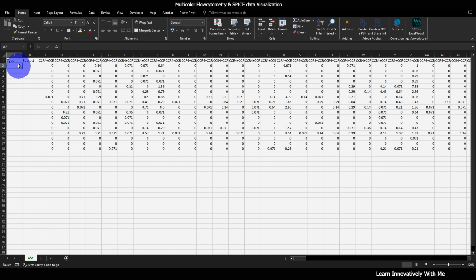So first is asymptomatic, I'm going to provide the name asymptomatic up to 6 because we have 6 samples, and the subject number like this.